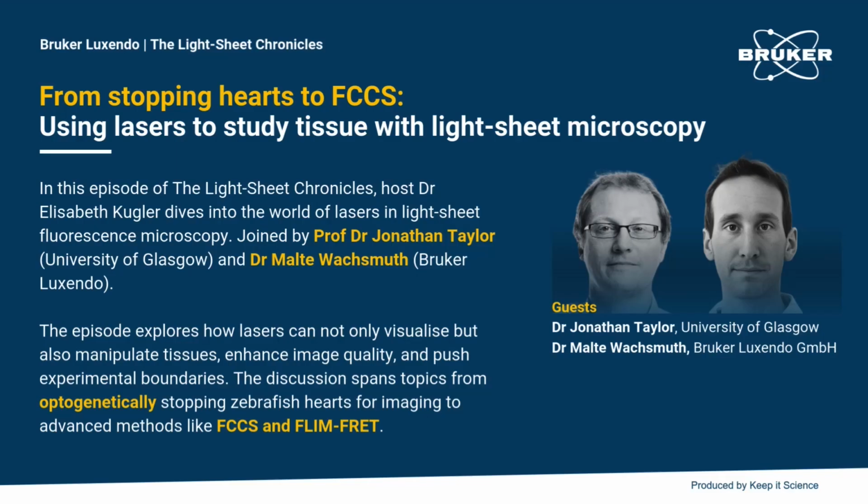A whole other story about the imaging hardware, the cameras, to be able to make these measurements in a wide field manner, where traditionally it was done in a point scanning regime, means that we're a little bit limited in field of view at the moment. But yes, I think that question of how this all integrates across different organs and different regions of the fish in our case is a really interesting question to explore.